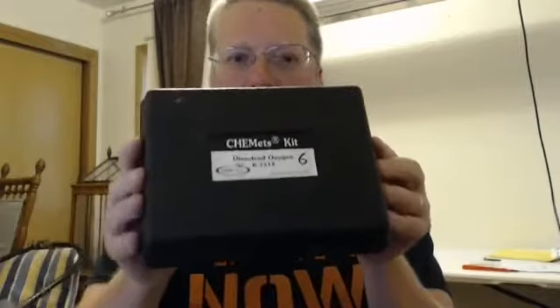So, you will obtain a sample in a beaker like this. Today, we will do fish tank and we will do tap water. Most likely tomorrow, we will do Squaw Creek and something called a bioreactor. First thing you need to do is open up the kit that looks like this. It is your dissolved oxygen kit. And in there, you will find something that we will call the sample tube.